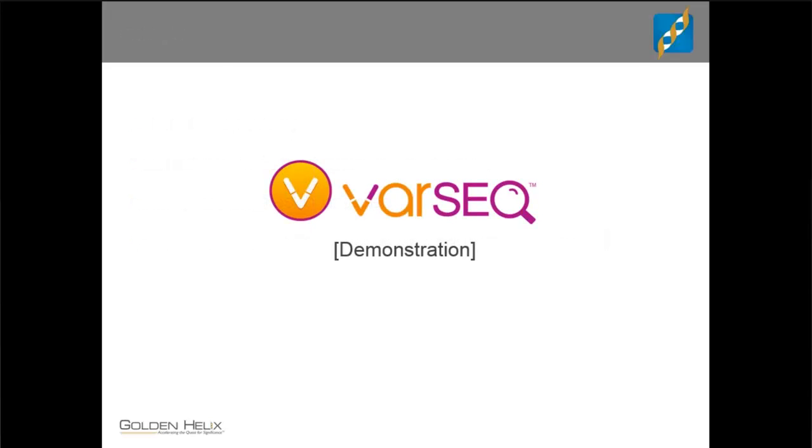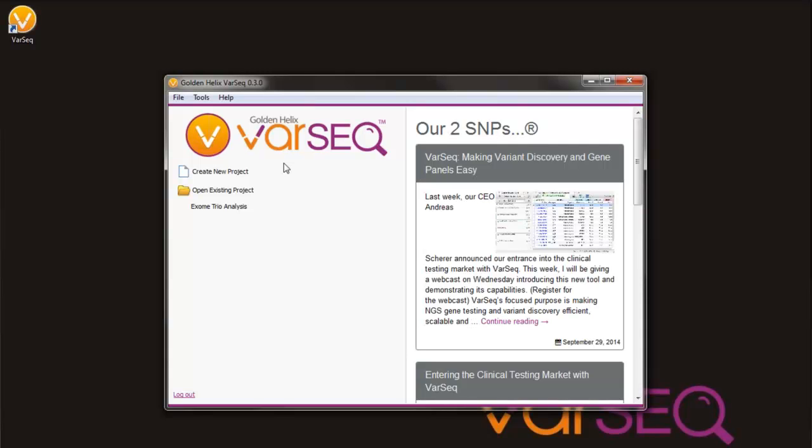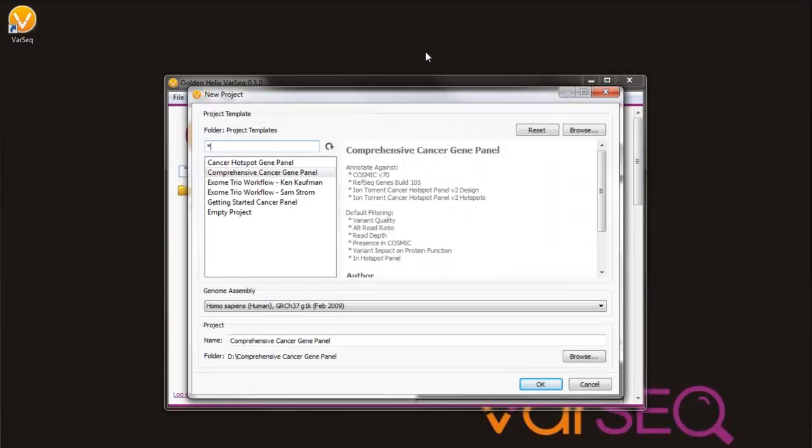All right, let's demonstrate VarSeq getting started here. So here we go, I'm going to launch VarSeq, and again, the getting started process is going to be very straightforward. You can install and register VarSeq when we ship it to our public audience, and if you are running in the free viewer mode, you'll be able to open existing projects, and as soon as you have a licensed copy, basically your account just has a license applied to it, it turns on the flag to be able to create new projects. And as I mentioned, we're coming fully stocked with a set of gene panels.